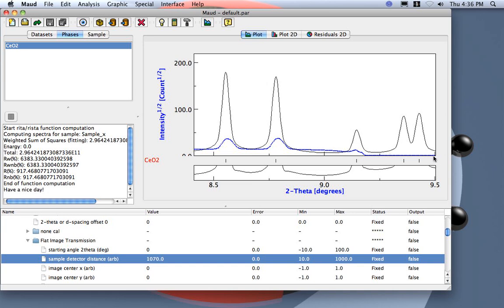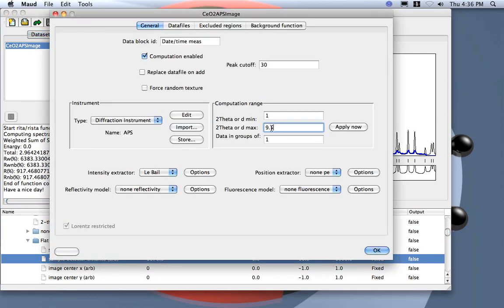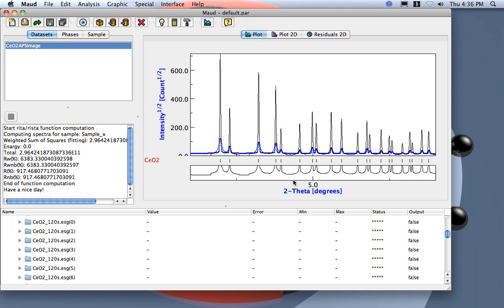At 1070, yes, here it is. Now we have another problem: by changing the distance we shifted everything, so 9.5 degrees is actually out of the detector range. We need to set a new limit — let's say 9 degrees. We go to the dataset and change the range from 9.5 to 9.